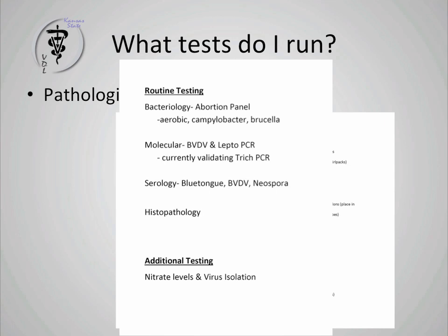That, including the Trich PCR, which would soon be available, is going to be somewhere between $210 and $230, I believe. I don't know the exact number. If you pick and choose, obviously it depends on what kind of testing you pick, but we hope you pick the right one. It's not so much picking the right one, but checking specific tests ties us into that specific testing.